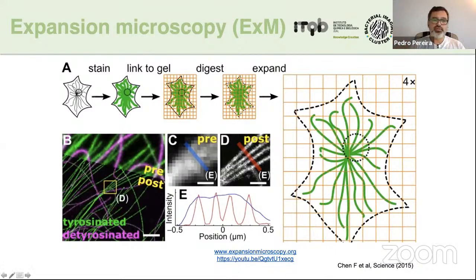This is just an example of what you could see pre and post expansion. If you're curious about this, there are many papers, obviously, but there's also expansionmicroscopy.org, where there are loads of protocols, and these are from the Boyden Lab, one of the developers of this technique, and they have a wealth of information. And if you want to see another example, you can see a YouTube video I have of me doing the protocol, which might also help you to get started. And you can also see me make a fool out of myself, which is also interesting.